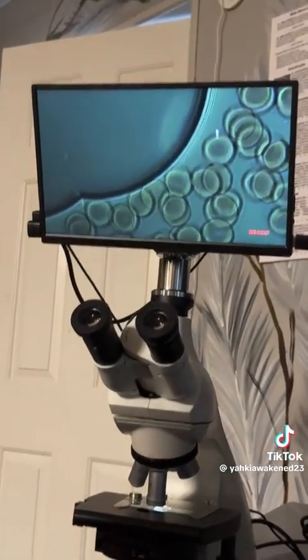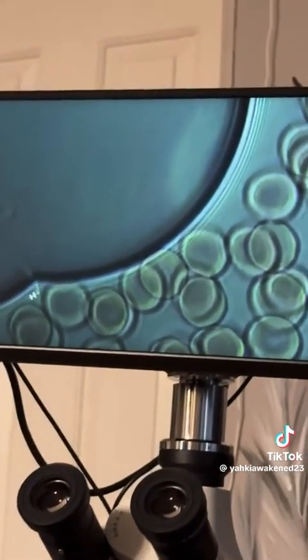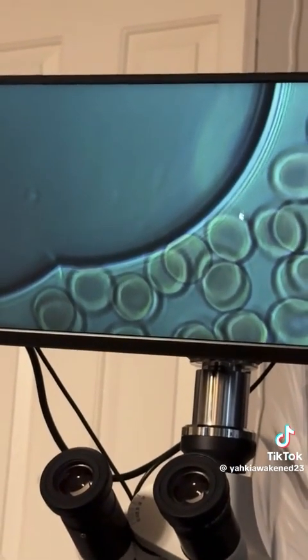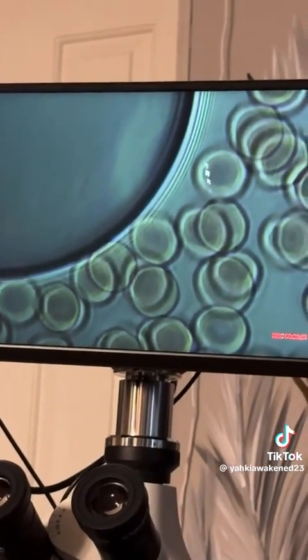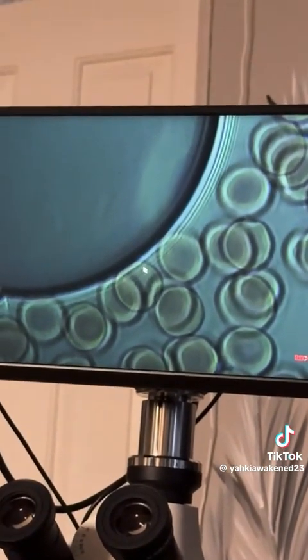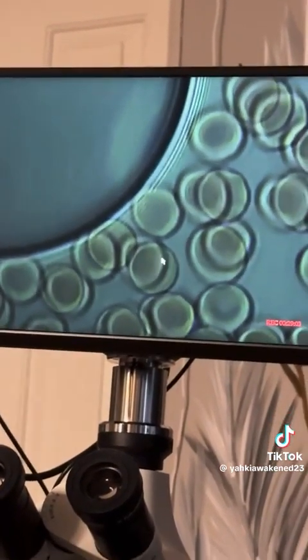So when you get right here, this happened from my stain when I took the blood from my patient, or from my family member, should I say. And this is what you will call a line of aggregation. You have a line of aggregation and you have a line of lysis. So you never should judge or do your assessment based on any red blood cell, whether it's on a blood cell, tissue cells, anything that's next to your stain, like trauma that happened to your slide. You should never base your knowledge or judgment off of that, because usually it's an inaccurate reading. So we're going to move past that. We're going to go to the right.